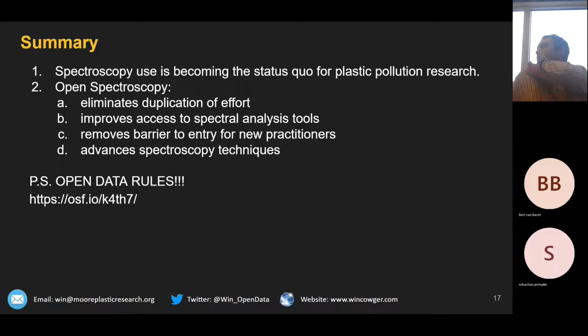Another thing: maybe you are only talking about trying to do one identification in the spectrum. What we often see in Raman is that you need to identify two materials at the same time. So this would be, say, okay, I have material A, which is the polyethylene, on silver background B. Do you think about implementing something in the future like that? So you can choose either to be as good as possible or say, okay, test for two components. Right. Yeah. No, that's a really good question.